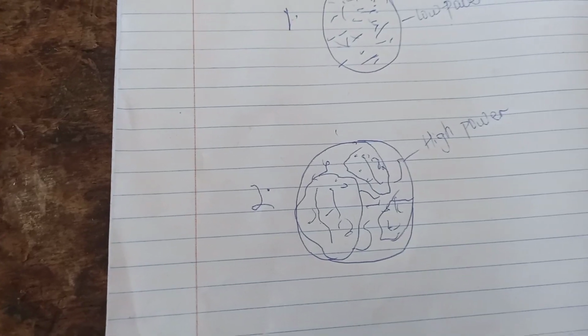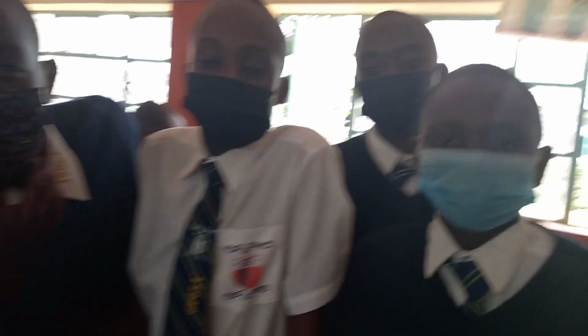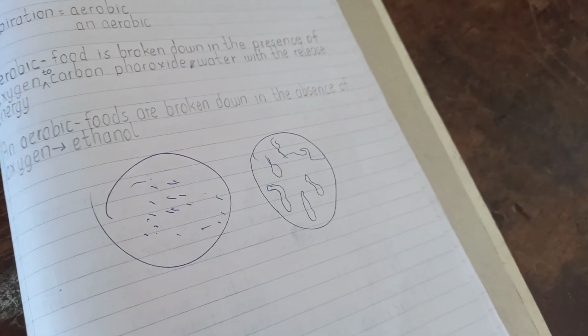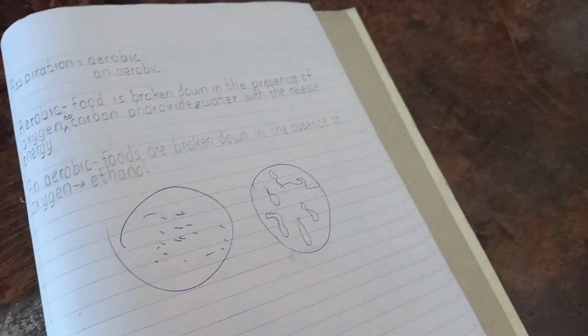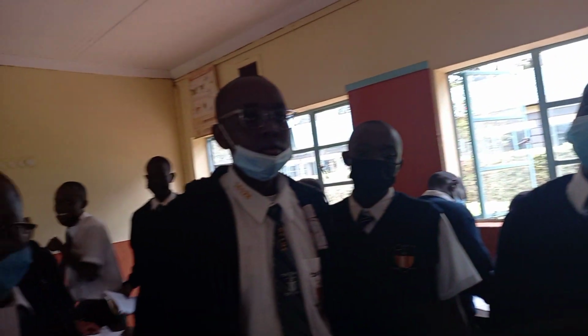It starts to show internal details, so it zooms more. Remember we said it enlarges or magnifies more. What difference do you see? For the low power, the image of the organisms appears tiny. But for the high power, it appears clearer and larger. So the high power magnifies more than the low power.